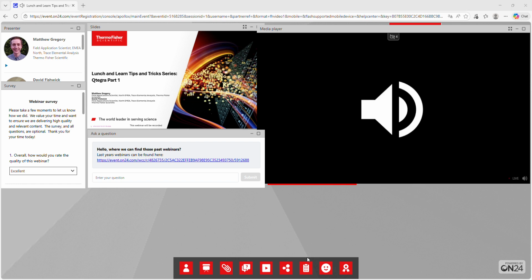Was that not a real question? Is this just a starting point? That's fine. I think David's having maybe some problems with his microphone. So this is a question about the auto peak. Is it? Yes, about the auto peak from the method, which was very useful because we do not need to select all wavelengths again.